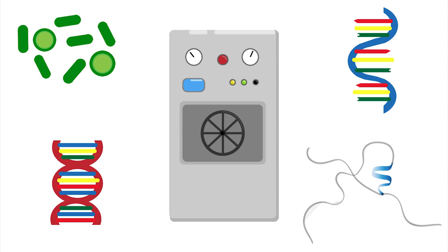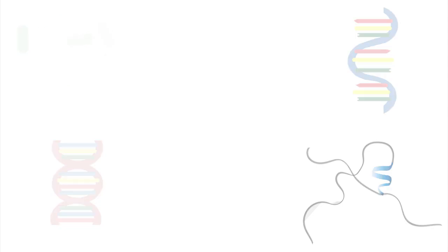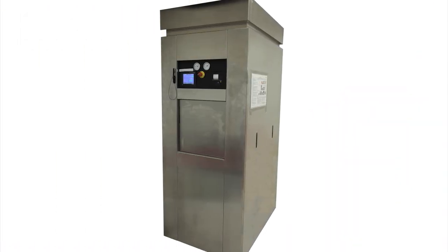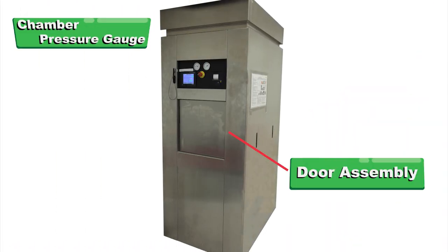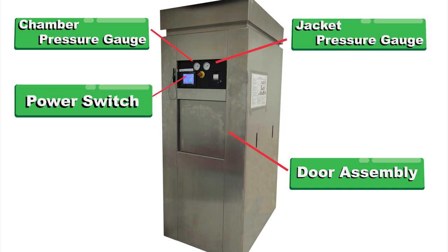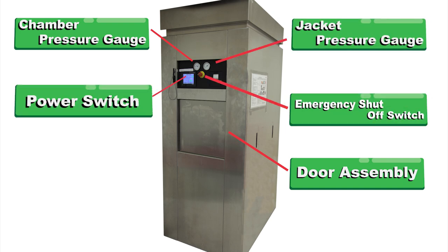To better understand how steam autoclaves work to sterilize materials, let's take a look at a modern large capacity autoclave, such as this one. We can see the door assembly, chamber pressure gauge, jacket pressure gauge, power switch, emergency shutoff switch, and control panel.